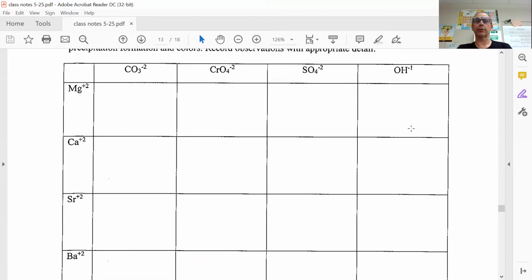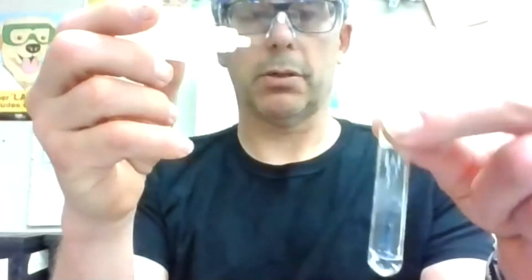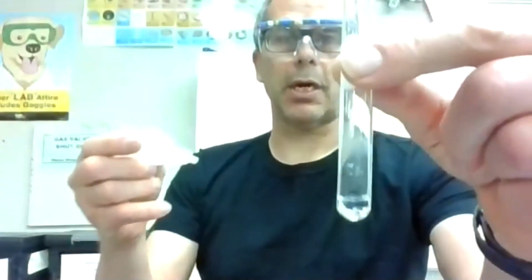I'm going to go full screen here, I think. And notice what I'm doing. I'm going magnesium, calcium, strontium, barium down the list, and then I'm going to add CO3 to that. Okay. So our first step is I have this. Let me get it where you can see this pretty well. And I have my magnesium. I'm going to add CO3 to it. Get this in a spot where you can see that. Give you a nice backdrop.